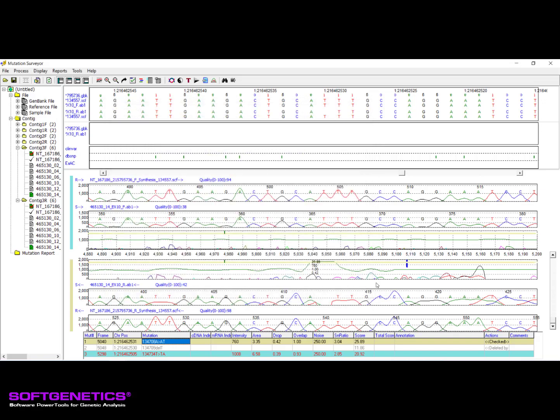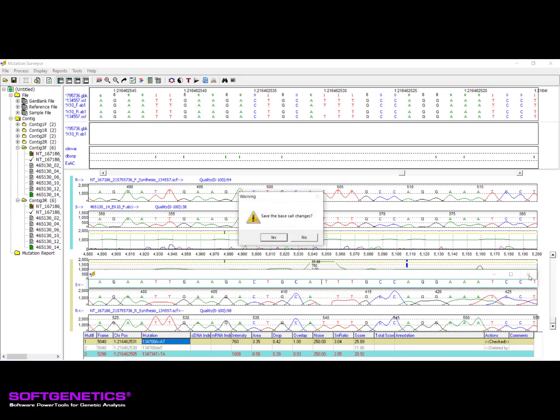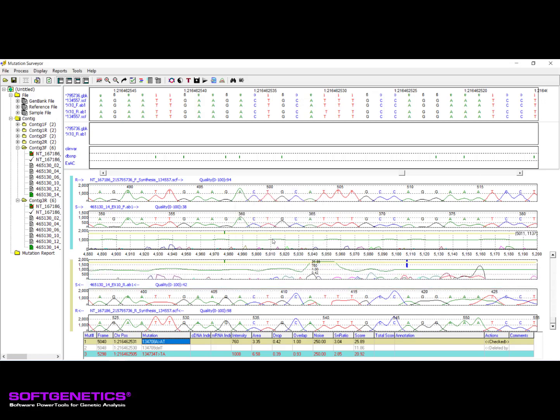In addition to editing mutation calls, the GAD allows for editing of base calls of the reference and sample traces. To edit a base call, right-click in the trace to edit and select Edit Base. In the window that appears above the trace, left-click the desired position and edit as necessary. When done, close the window using the X in the right corner and then confirm to save your changes. The analysis will not be reprocessed unless selected to do so. An option also exists for saving these edited files.